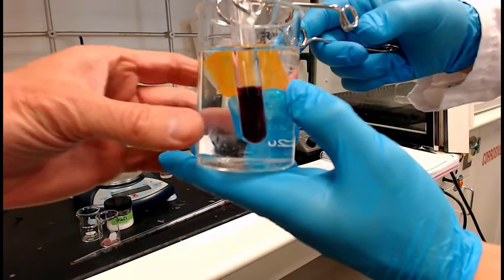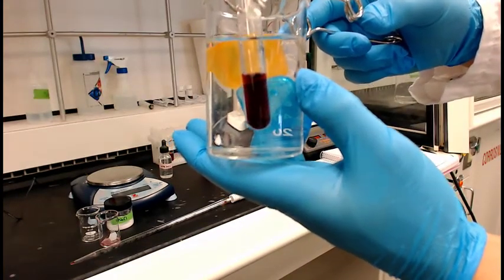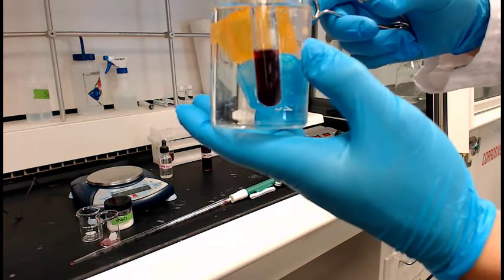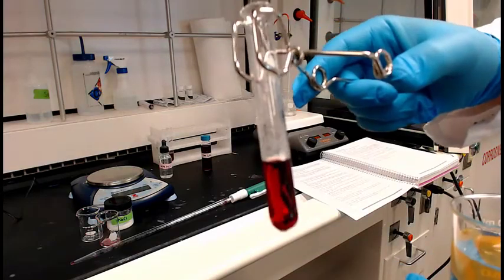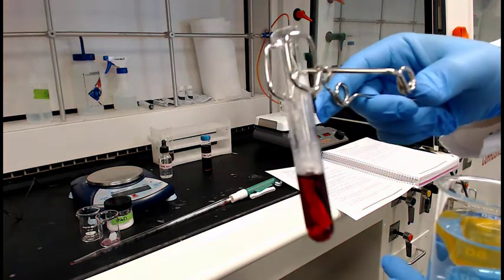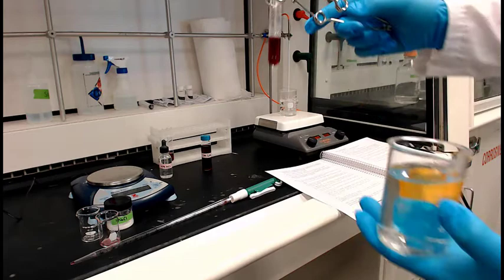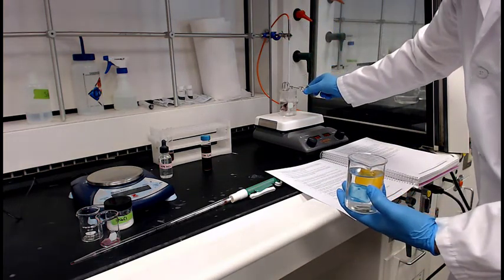Checking the temperature. Good. Looks like somebody, yeah, this is the clear one. That was probably Dr. Thompson without gloves. I think what I was telling him is move it away from the blue cube. There, oh, perfect. When I hold it there against the white background, the perspective really pops. Okay, so that definitely pushes that cold, pushes it back to the red side. Hot. Good.